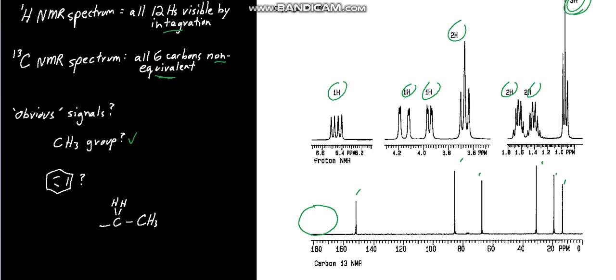Do we have your typical aromatic benzene type ring? There ought to be 6 carbons in the aromatic region, and several protons, you would think. So in fact, this is the aromatic region here. If anything, there's only one. That, of course, doesn't make sense. So no, we do not have an aromatic ring. Further, we would have known that because this would have been 4 unsaturations, not just 1. All right, so let's go back to our methyl group.